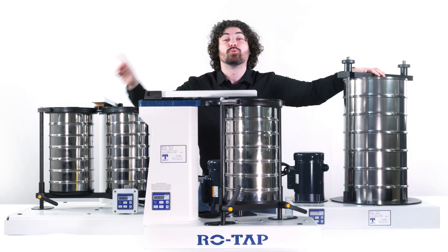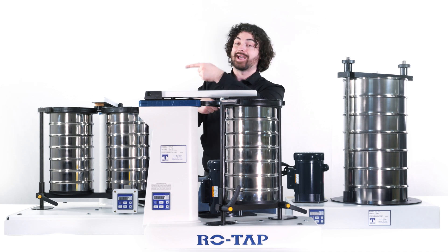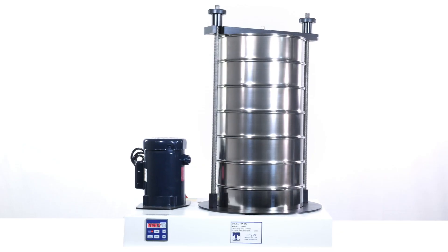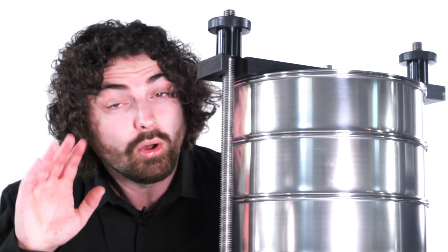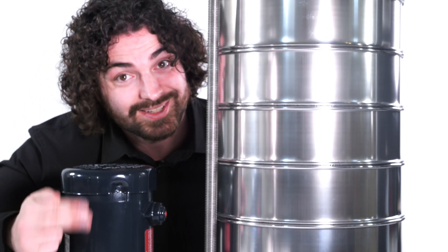This is W.S. Tyler's mechanical Ro-Tap series, and it does exactly what it says — it rotates and it taps. These oscillating and tapping motions are so precise and so consistent that they can be used in the most heavily regulated industries imaginable. They're all designed to get the particles placed in the top sieve and separate them through their specific sieves to their individual sizes.